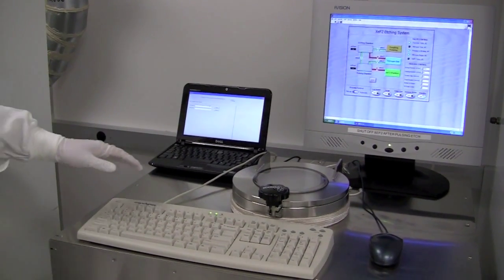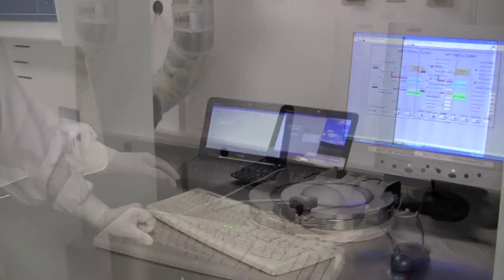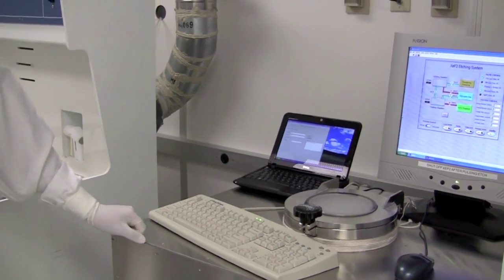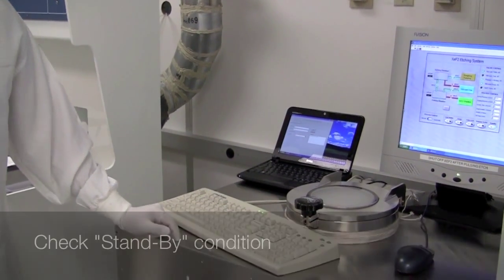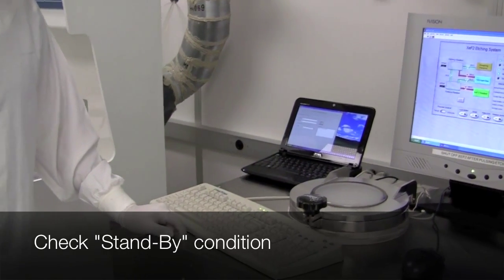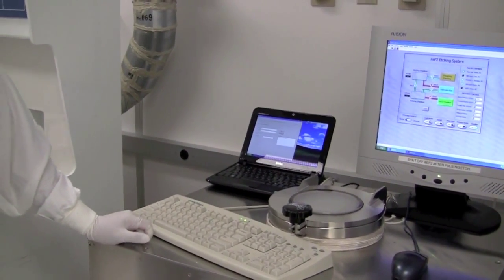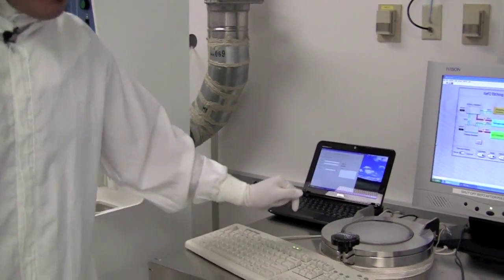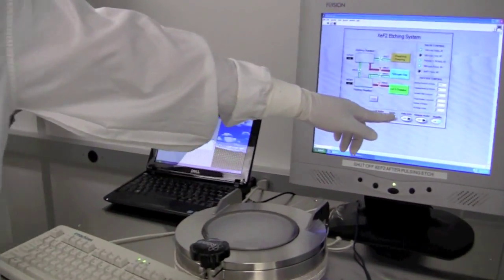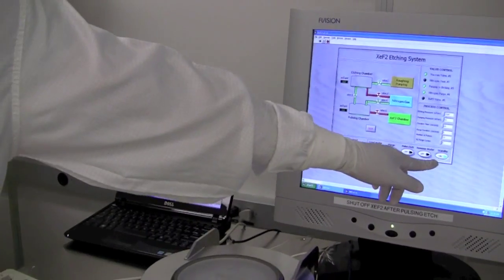Now before we start using the tool, I want to remind you to always log in. After we've finished logging in onto the computer, we want to make sure the tool is in good standby condition. There are a couple of things I want to point out to make sure the tool is properly in standby mode. First, you want to see that this screen says standby mode, and it should have a green button on it.